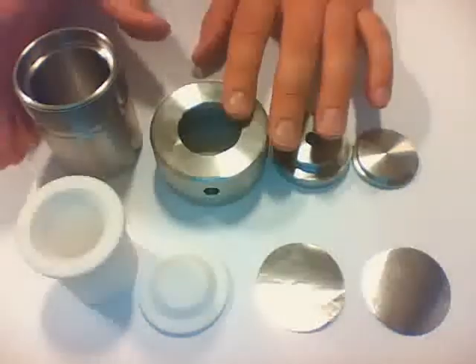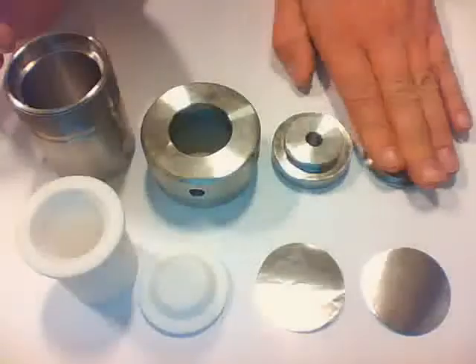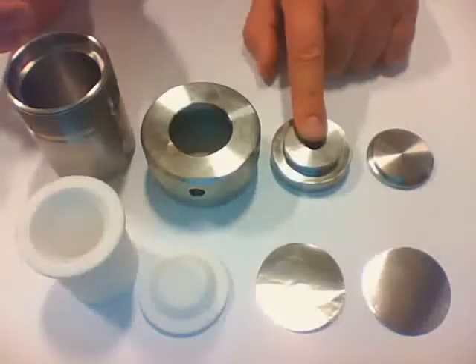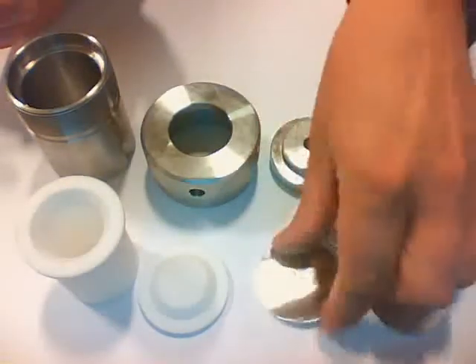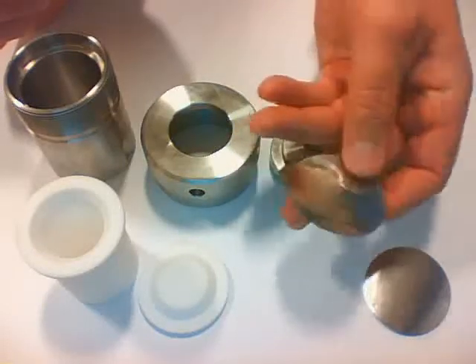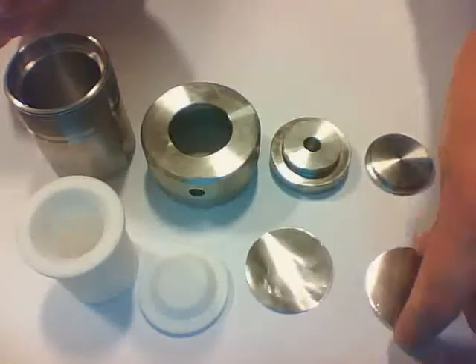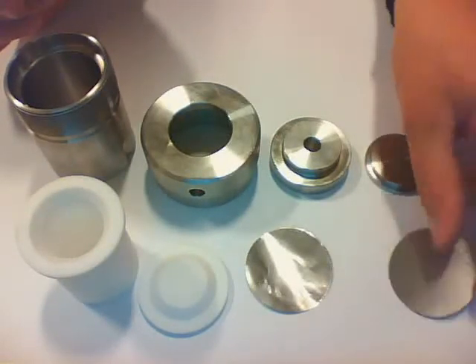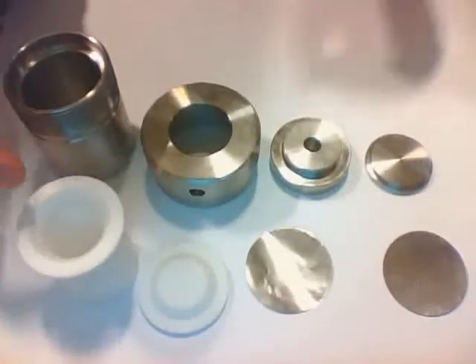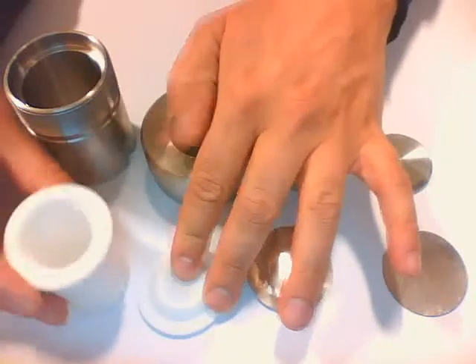The steel parts include the main body itself, the lid, a base plate, and an insert for the lid. On top of that we have a thin foil called the corrosion foil, which is to avoid corroding the burst diaphragm — the one actually holding the pressure inside. The reaction itself takes place inside the teflon vessel, which has a teflon liner consisting of a main body and a lid.